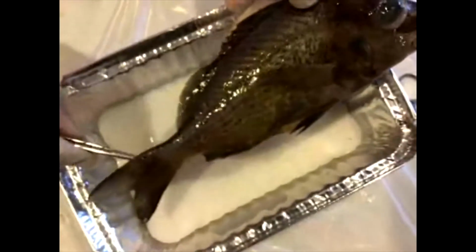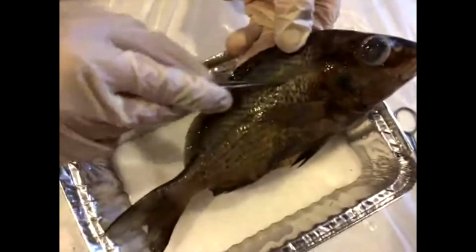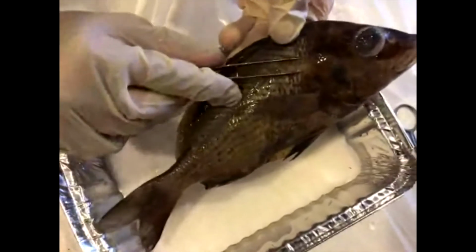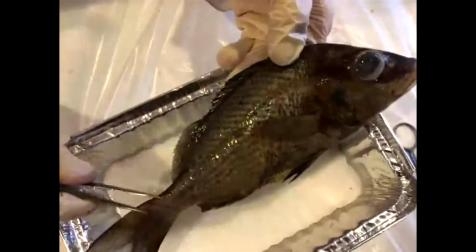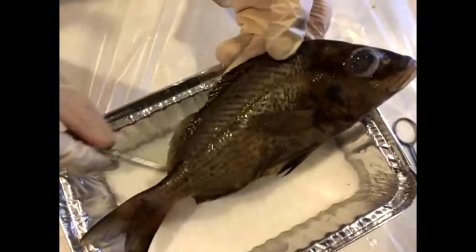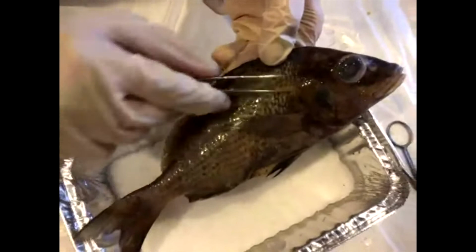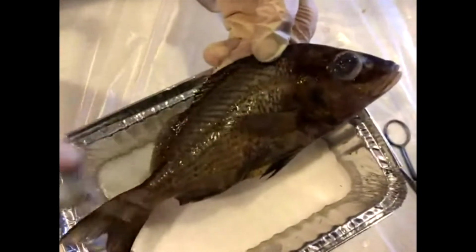We actually need a microscope, but along this line, there's all kinds of tiny little pores or holes into the fish's body that have special sensing cells on them. And so this fish can actually detect pressure differences in the water or vibrations caused by sound, and allows them to pick up signals from their environment that are similar to the way we hear sound and use it to decide where they go or what kind of prey they're looking for, whether they hide.